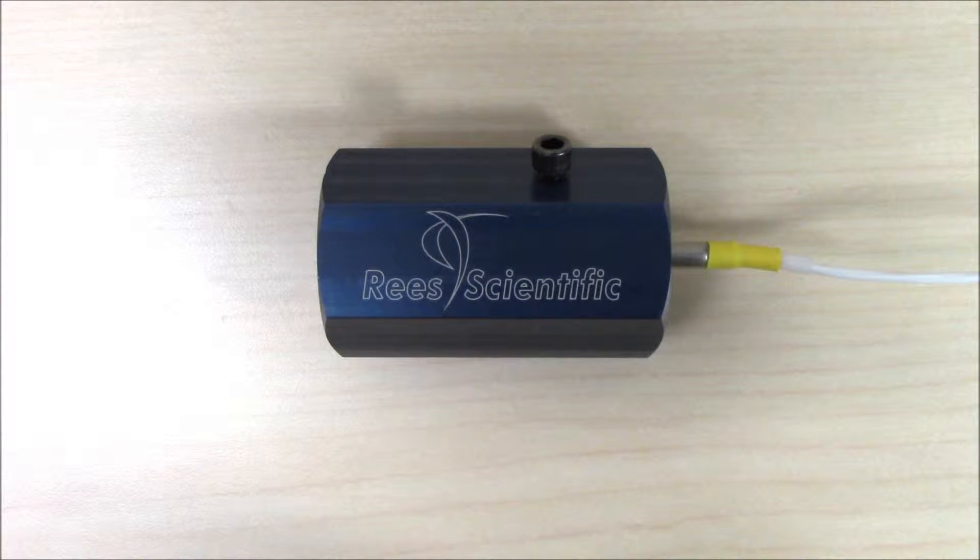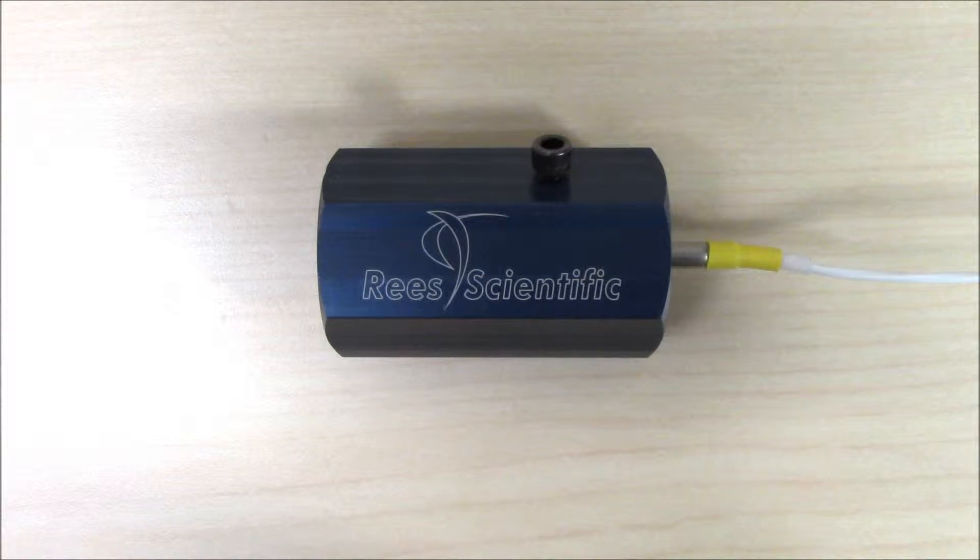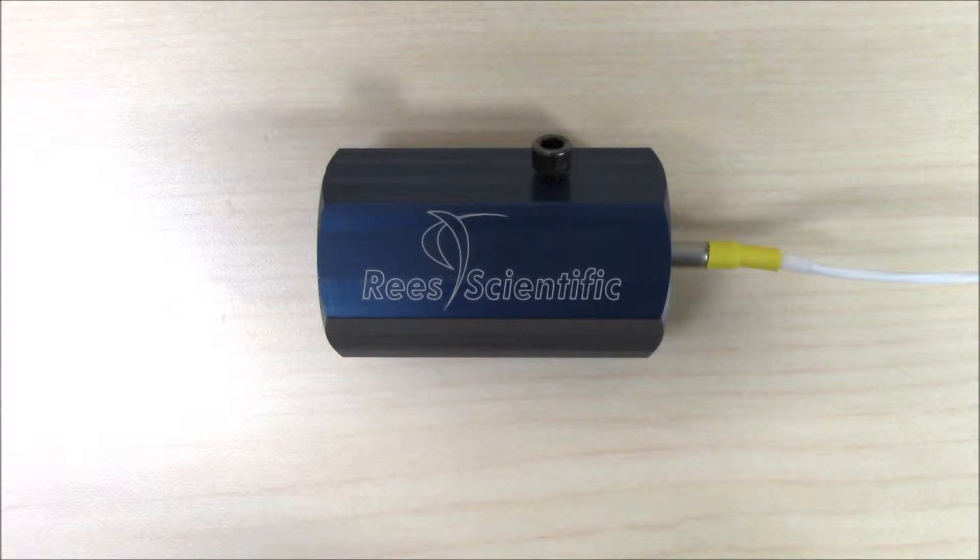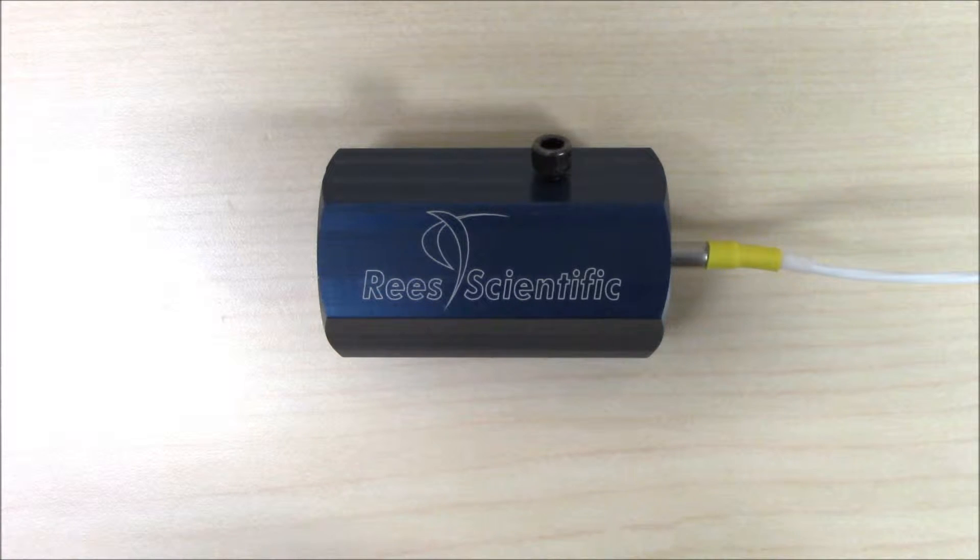The ReScientific Temperature Block is a cost-effective and simple tool designed to accurately monitor the true temperature of your samples without contamination.